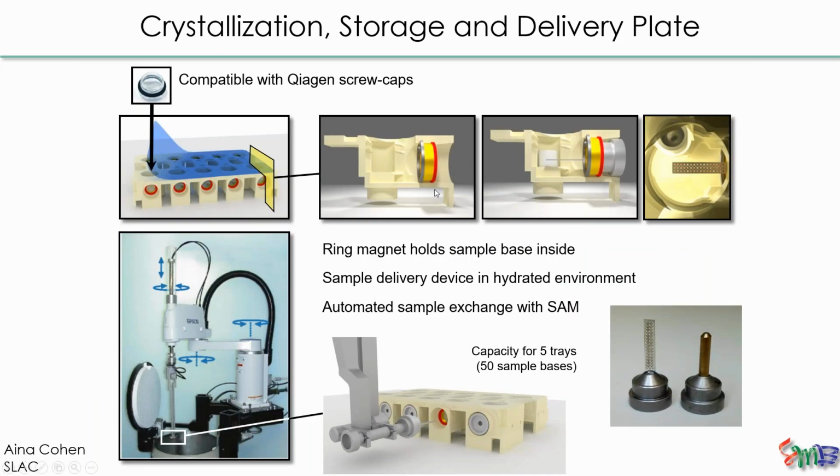Essentially what we do is these wells, there's a number of different wells that we can set up, and each of these wells can contain a variety of different types of pins. This is one of the pins that they have developed at SLAC, and essentially you can set up, as you can see, hopefully a large number of different crystallization conditions.